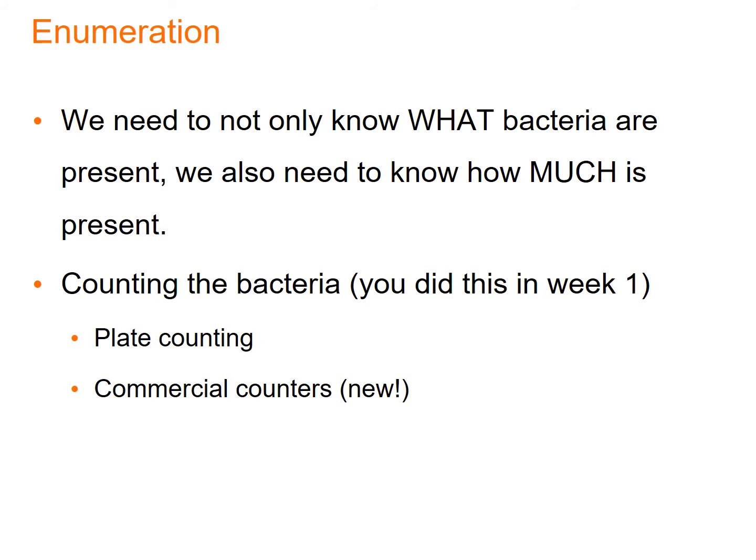We can also use some commercial counters, which is something new that we are introducing this week in lab. They are quick, but they are only semi-quantitative, so they're not particularly accurate, but they are certainly better than nothing. And we'll combine the 2 of these this week in lab.